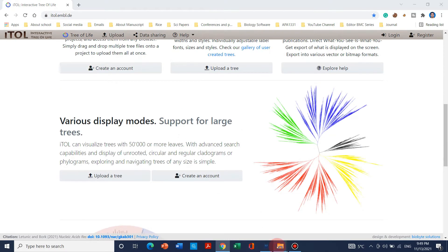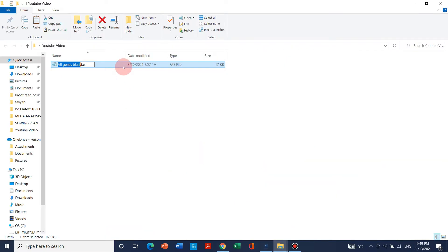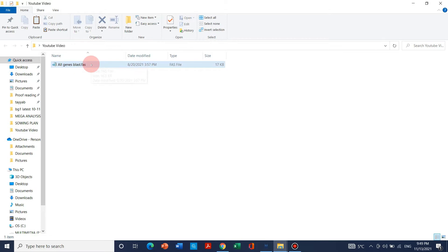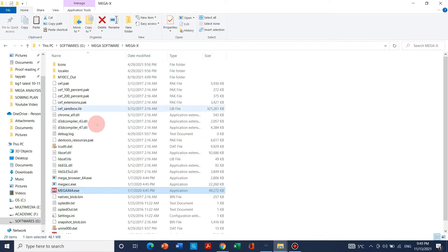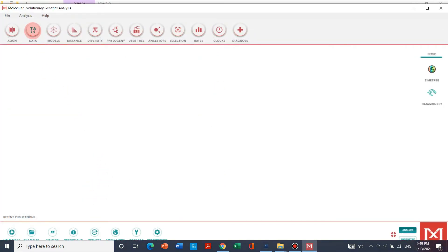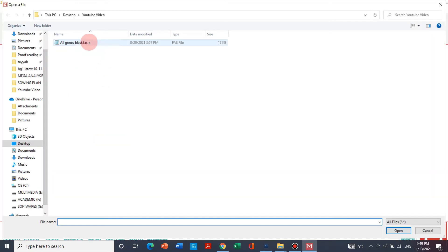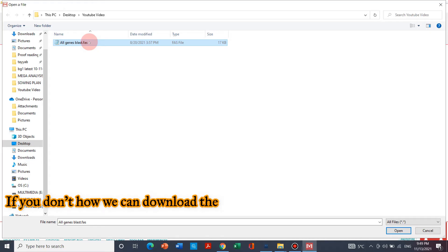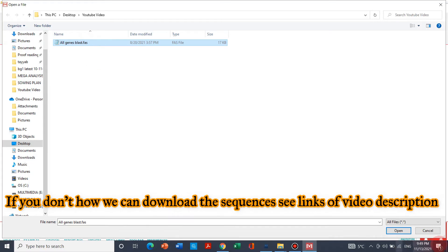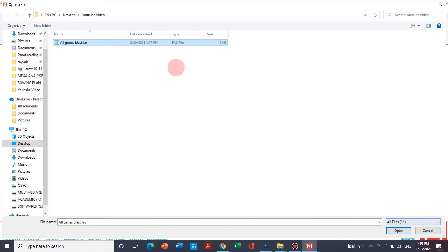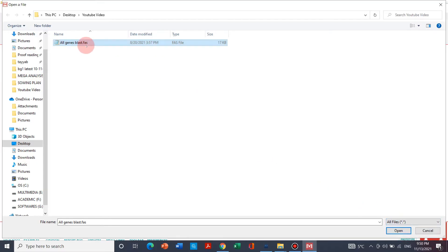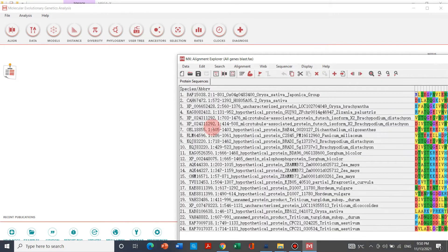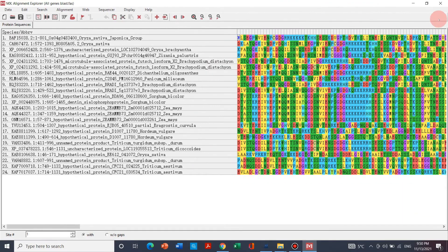Let's suppose this is the file which we have already downloaded and we want to create a new file format for our analysis. First we need to open this file into MegaX. We can go to MegaX, go to Data, and open a file session. This file is already downloaded — if you don't know how to download it, see my previous video. If your file is not showing, change the filter from Mega to All Files so your file is visible. Select it and open it; it will ask you to align, just click Align.